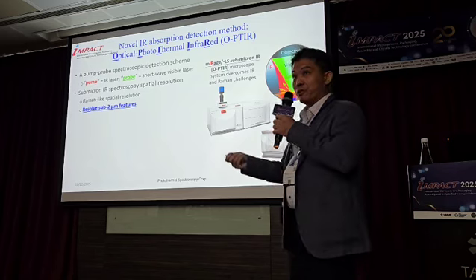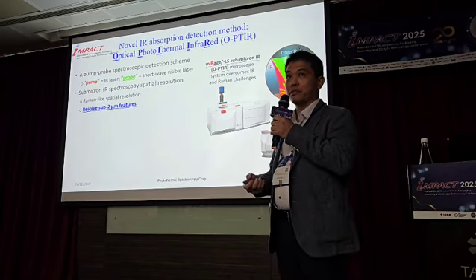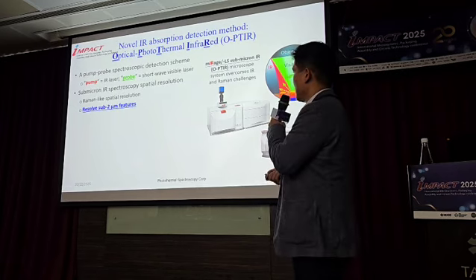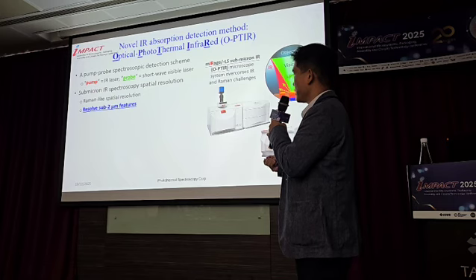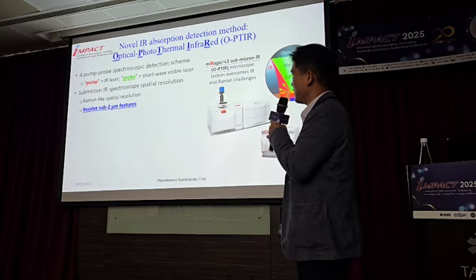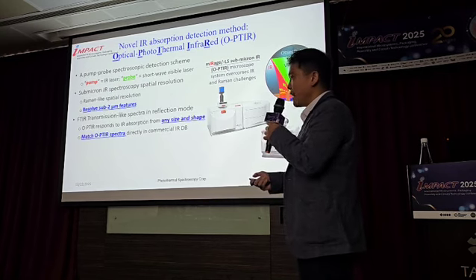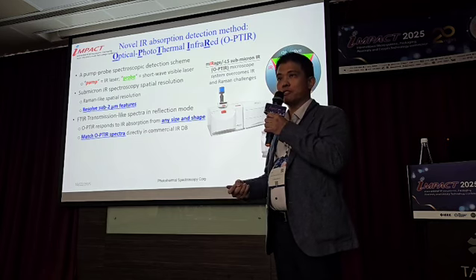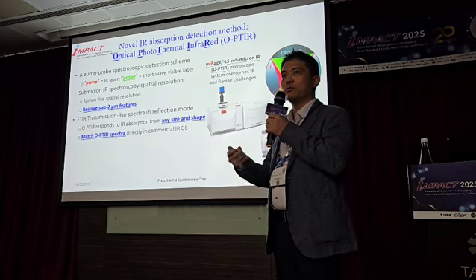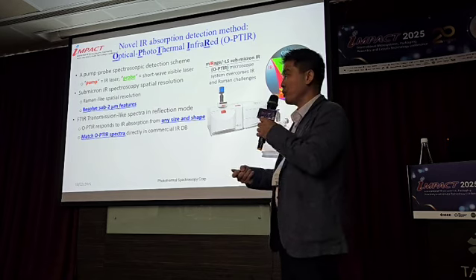Since we're now using a visible probe, we can achieve much higher spatial resolution than previously. So we can now get to a Raman-like spatial resolution, and we can easily resolve these sub-2 micron features. One added benefit is that even though we are doing this in reflection mode, which a lot of people would know that reflection mode FTIR didn't really work, for us, reflection mode actually does work.